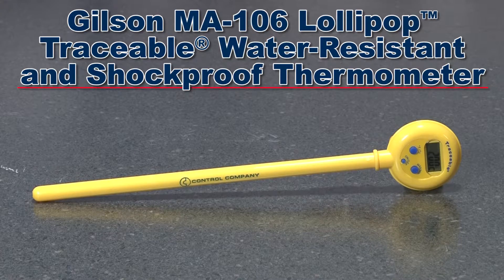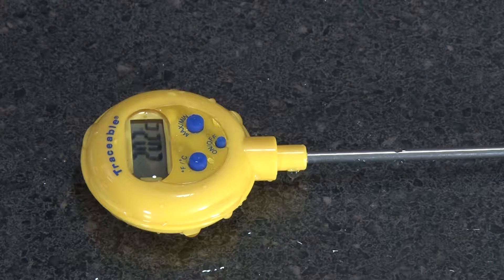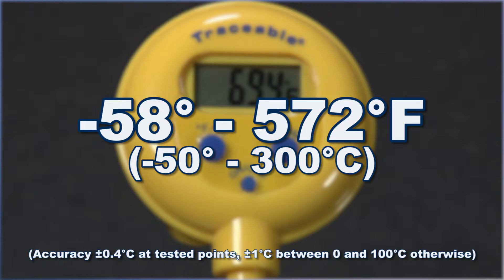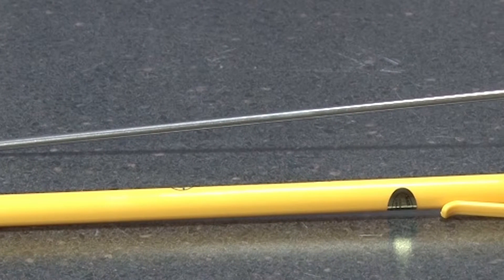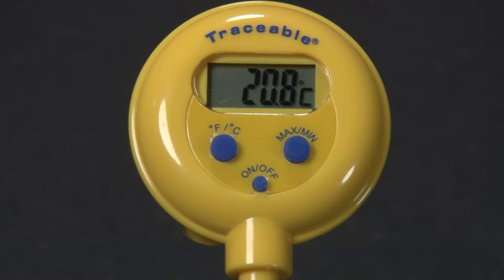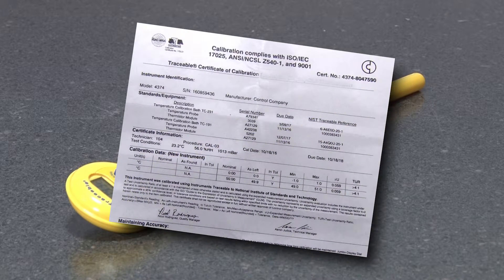The Gilson MA106 Lollipop Traceable Water Resistant and Shockproof Thermometer is ideal for wet labs, wash-down areas, and virtually all field applications. The MA106 has a temperature range from minus 58 to 572 degrees Fahrenheit, and the large LCD display is easy to read. The 8-inch stainless steel probe is resistant to most laboratory chemicals. The MA106 has a maximum minimum temperature recall feature, easily switches from Fahrenheit to Celsius, and is serial numbered with an NIST traceable certificate.